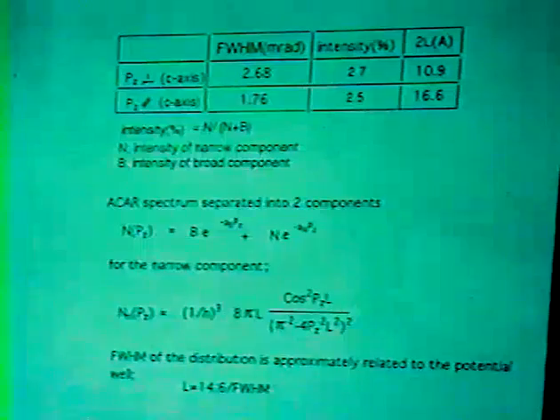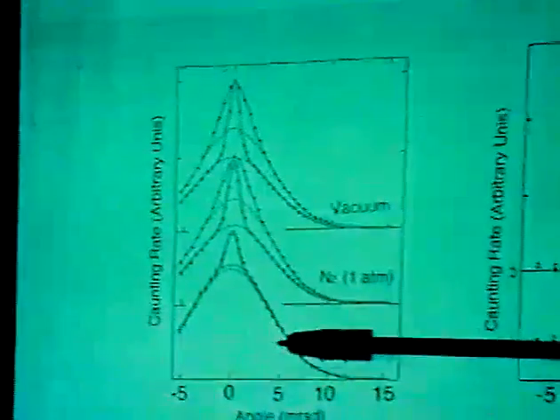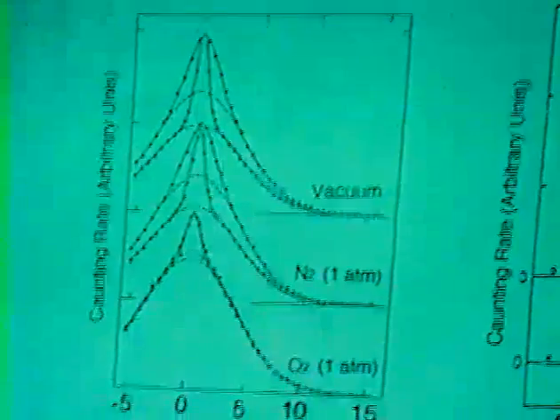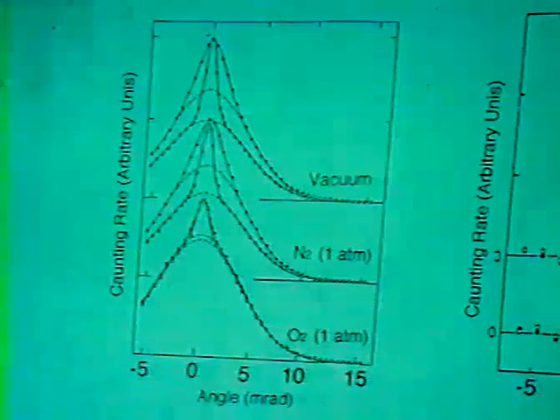This discrepancy is explained by the irregular orientation to the C-axis of the fiber sample, because we use a natural sample and not all of the fibers are completely oriented to the C-axis direction. Therefore, the FWHM of the ACAR curve can be used to determine an effective radius of micropore.